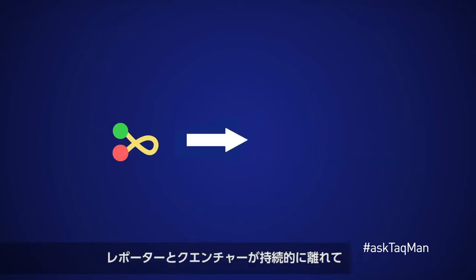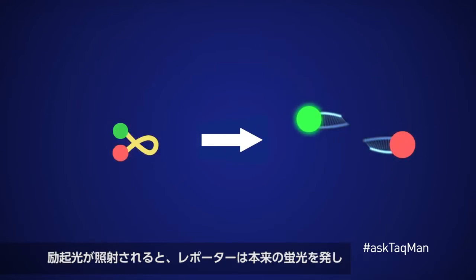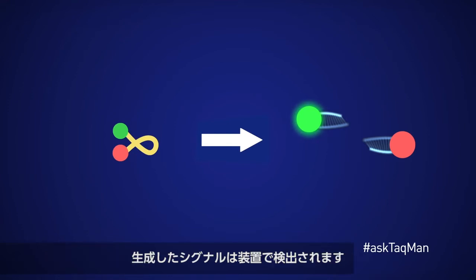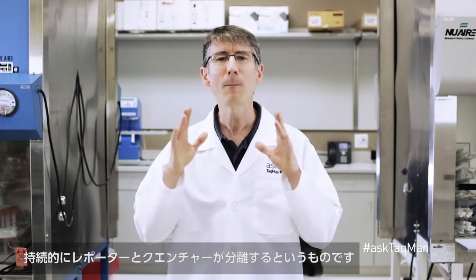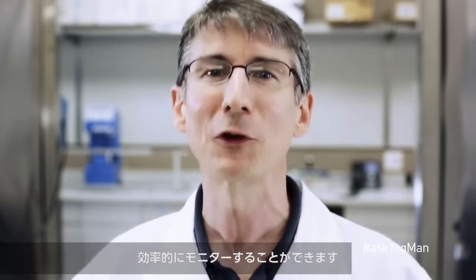However, if the reporter and quencher are permanently separated during the reaction and then light strikes that reaction, the reporter does in fact fluoresce, producing signal that the instrument can detect. The basic idea then is that each time we create a new PCR amplicon, we want to permanently split the reporter and quencher. By doing so, fluorescence will always increase proportionally with product, allowing us to effectively monitor what's happening in our reactions throughout the run.